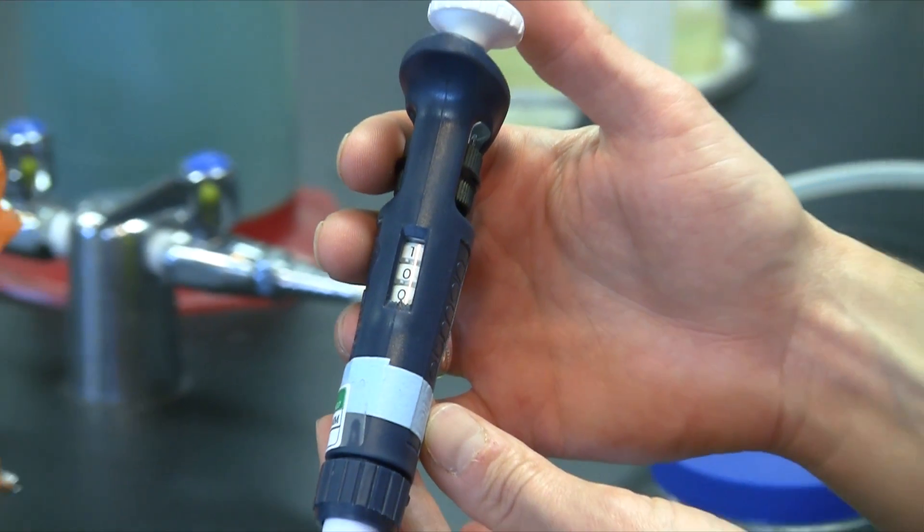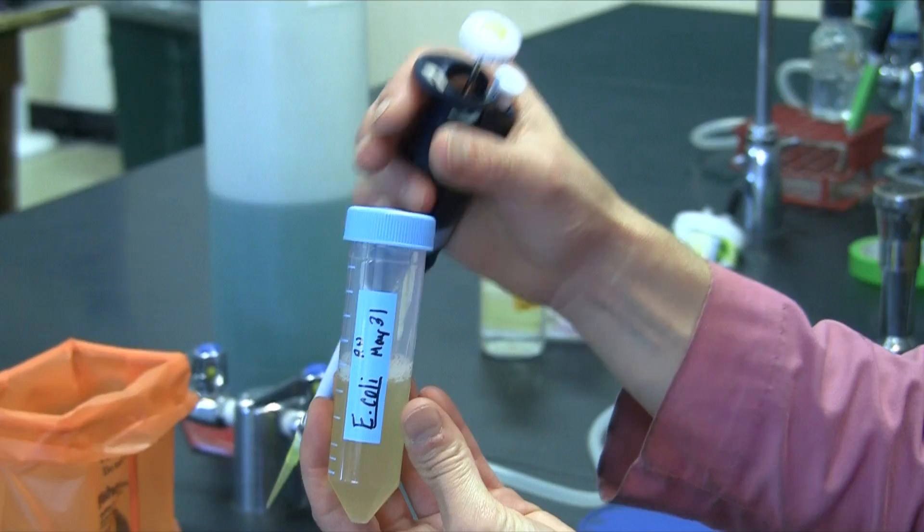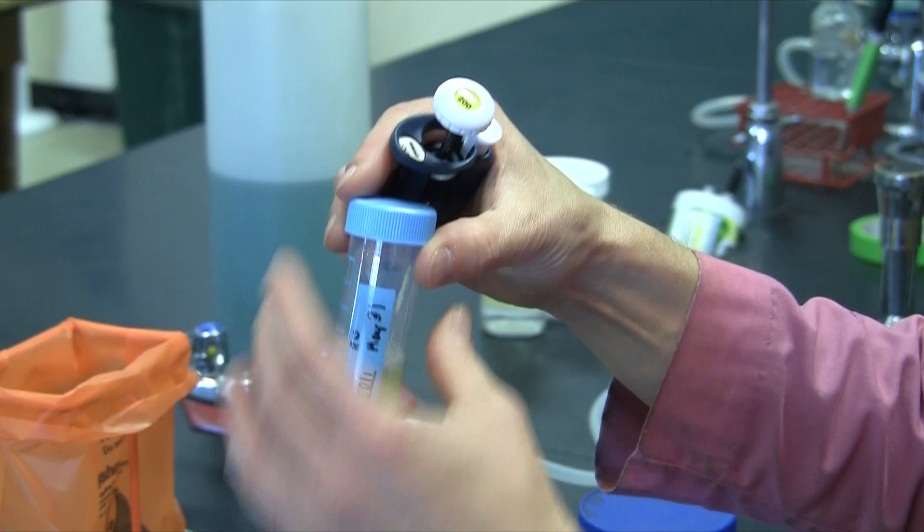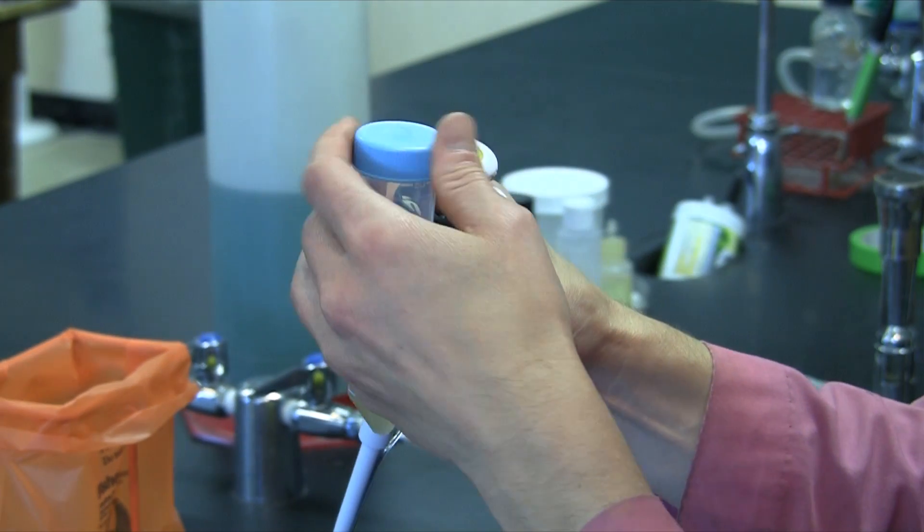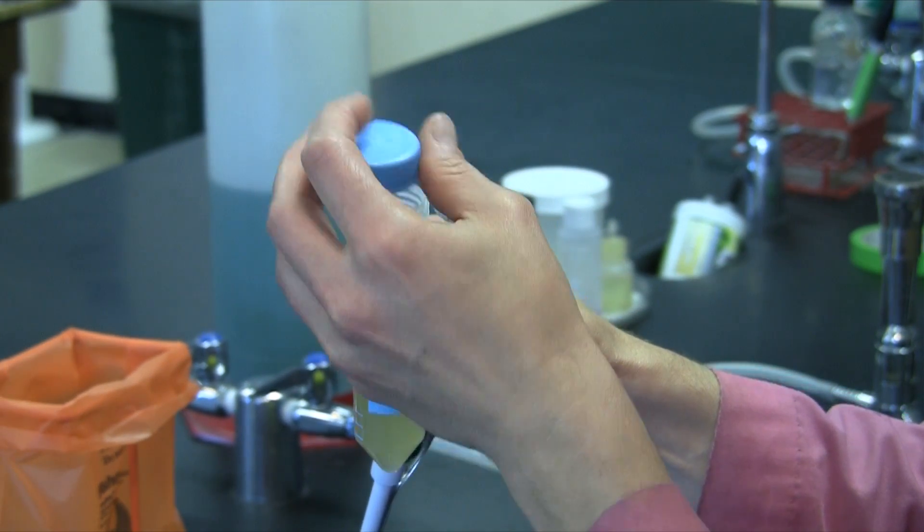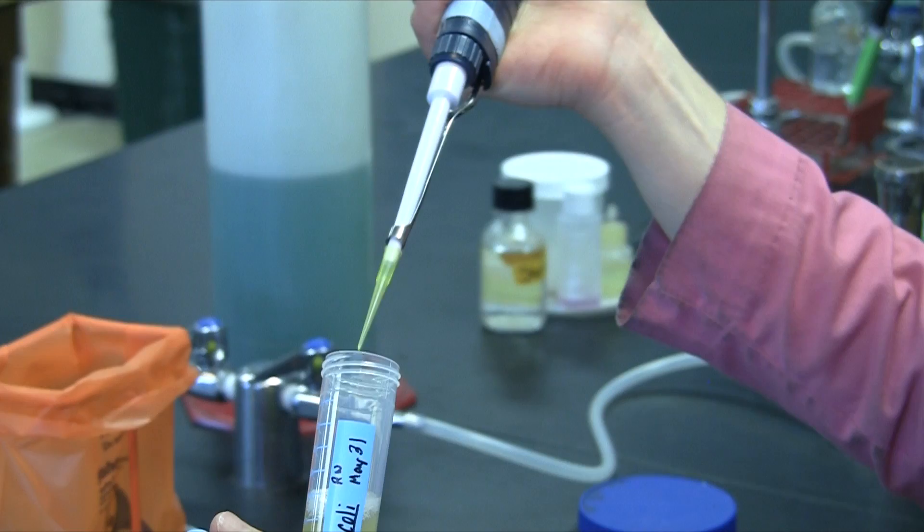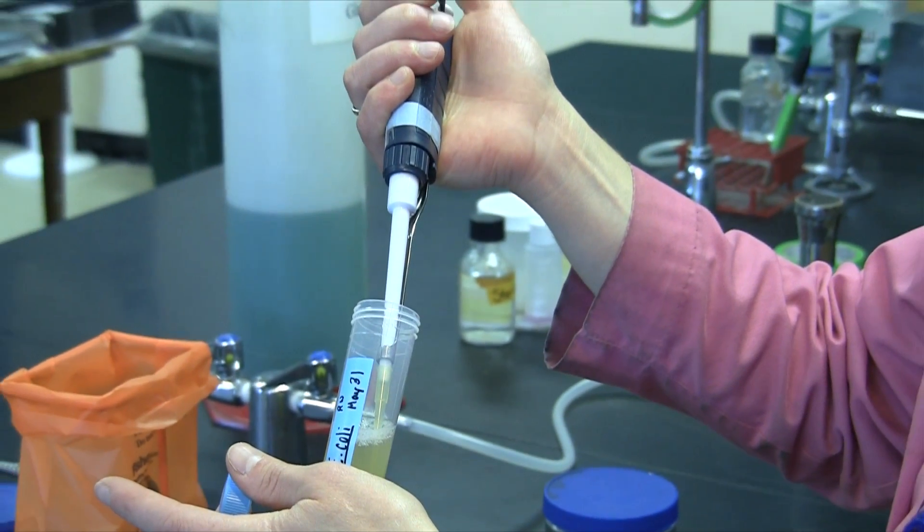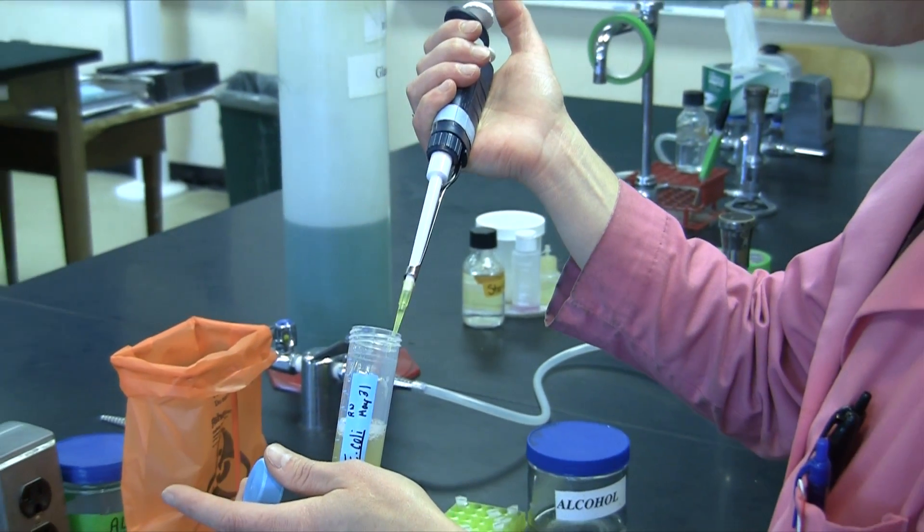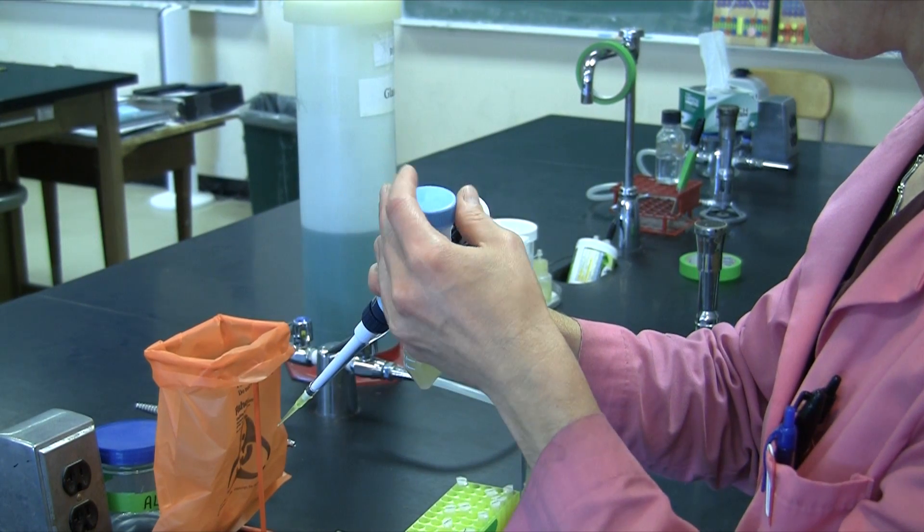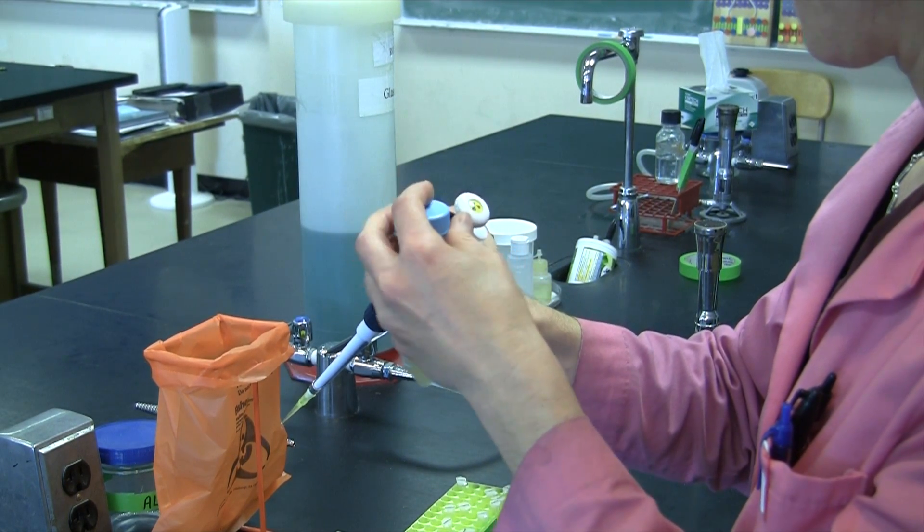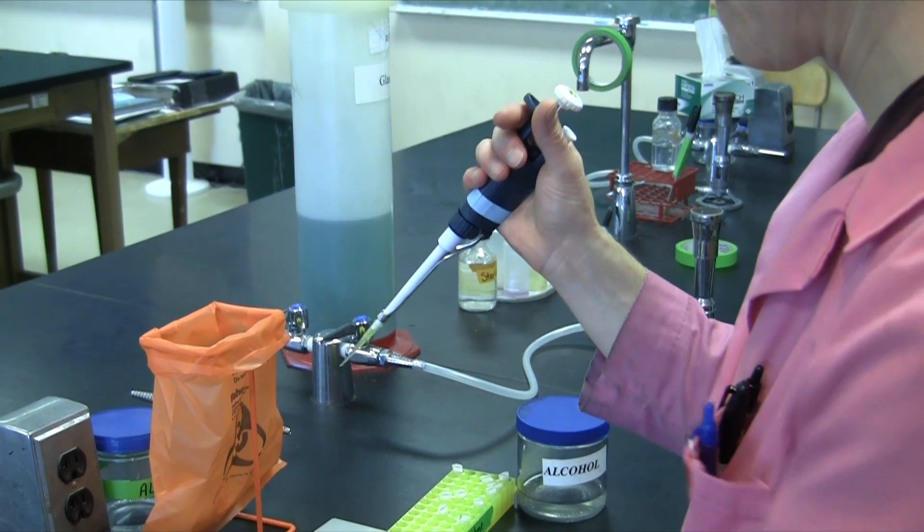We'll begin by putting 100 microliters, which is 0.1 milliliters, of E. coli onto your TSA plate. Remember that you can use your P200 to do this, set to 100. This is the conversion that you need to remember: 0.1 milliliters equals 100 microliters.